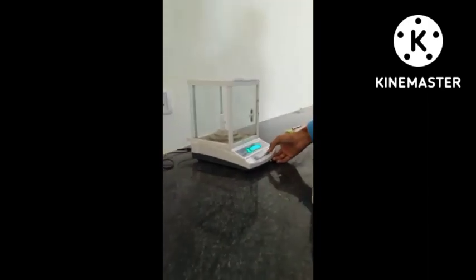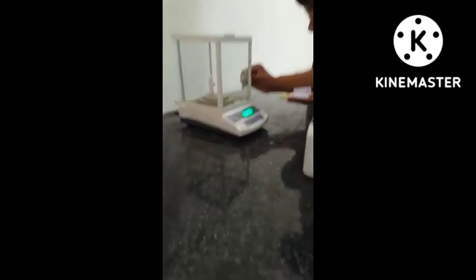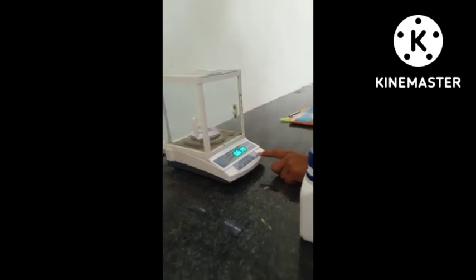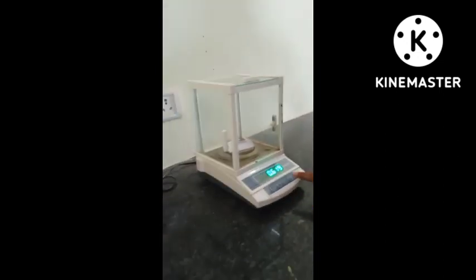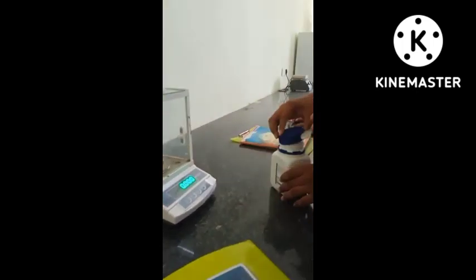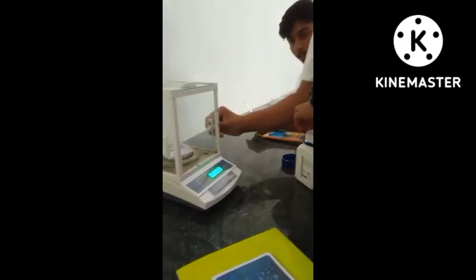Here you can see on a screen, this is a weighing machine, and on this we are placing one paper strip, and on that we are using sodium hydroxide, that is NaOH, and through that we are going to do the experiment.